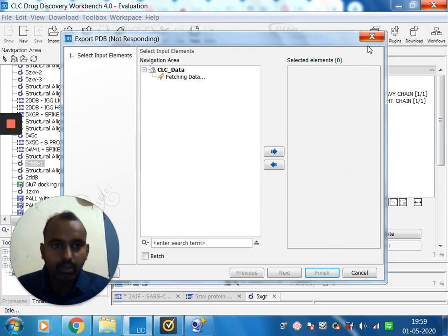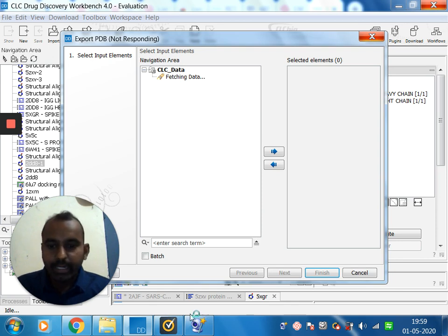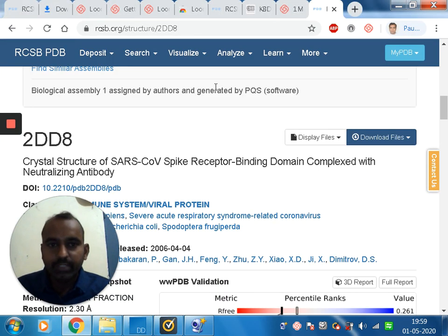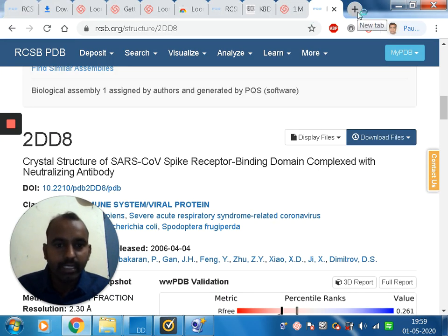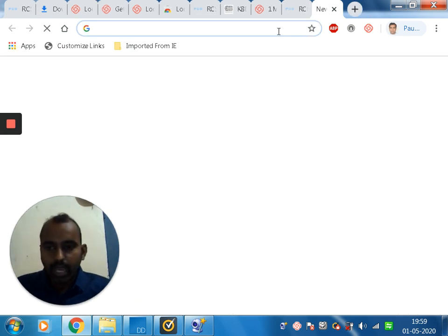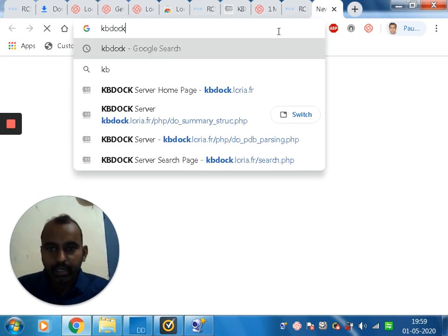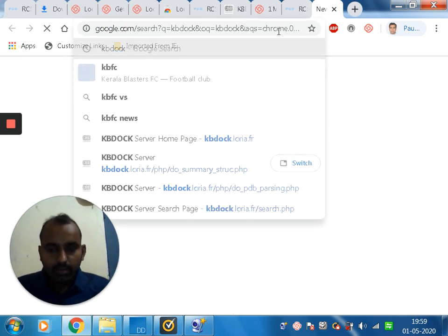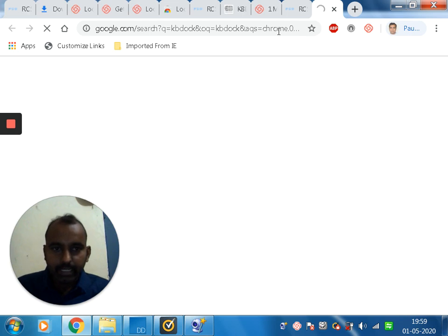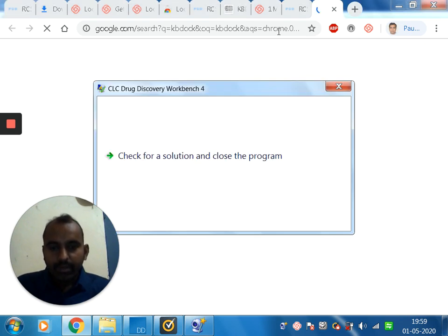Let me show you another method using a web server. The web server is KB Dock. I am navigating to KB Dock now.